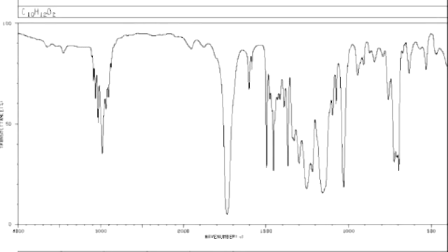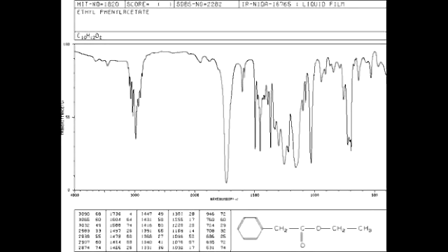Okay, now there's only one more thing to state for this molecule, and that's looking at about 1150. Also, there are peaks at about 1250 and maybe around 1000. Together, those signify that not only is this a carbonyl, as we knew from the peak at 1700, in fact, this is an ester. Those pretty sharp but not too sharp peaks around 1150 tell me that there's a C single bond O somewhere in this molecule, and together with the carbonyl absorption, I can tell that this molecule is an aromatic ester.